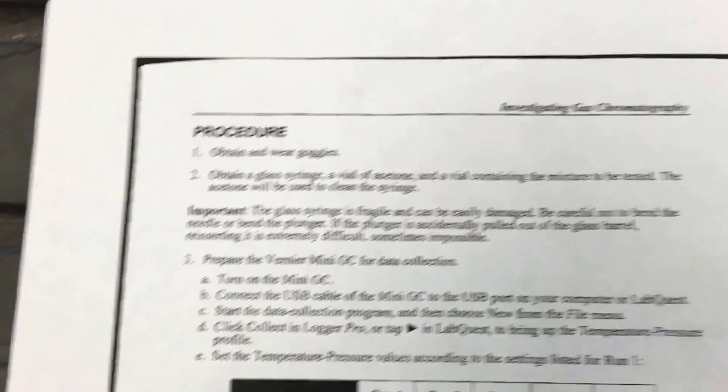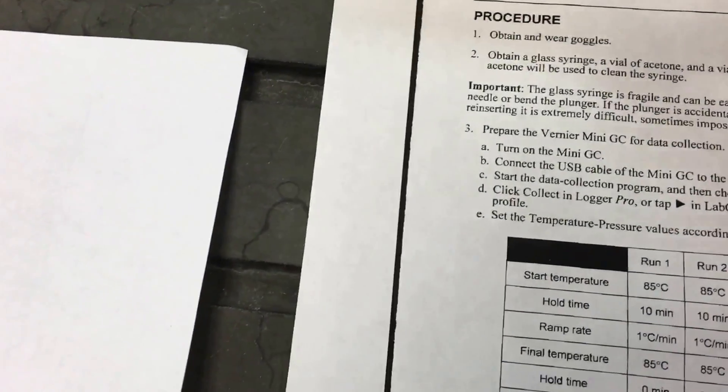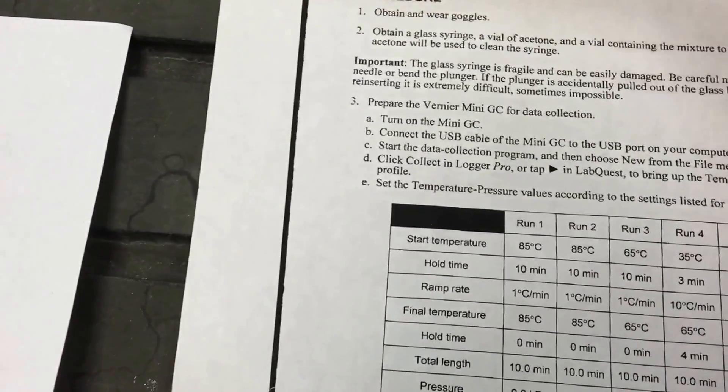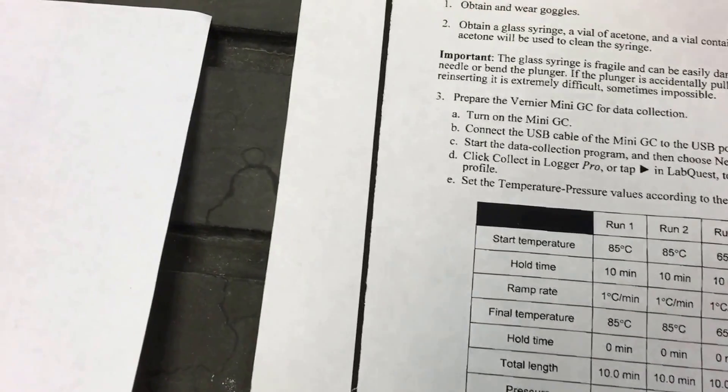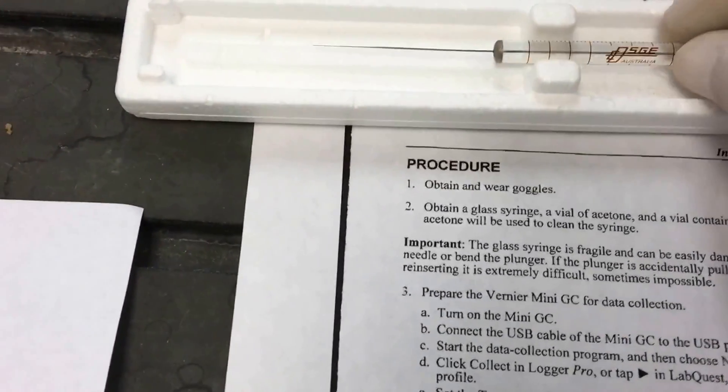This is the GC syringe — the Hamilton. It's very expensive and students often break it. The reason is it's made from glass with a very fine tip.